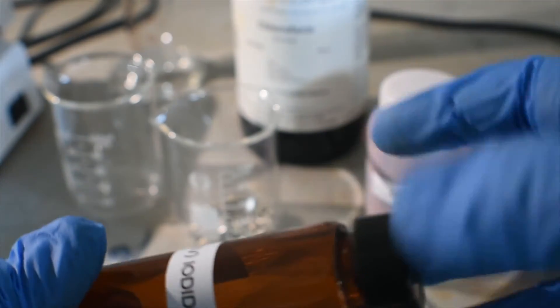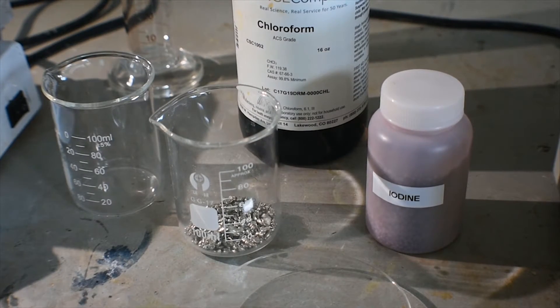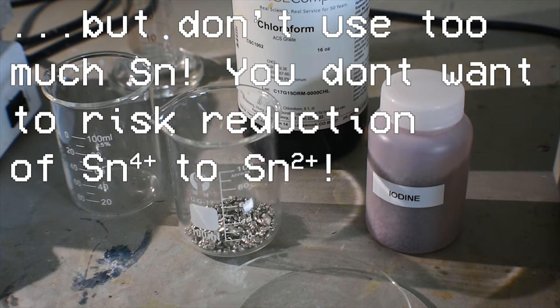First I'm going to measure out some chloroform and put that in the beaker. I'm not going to use exact measurements. This is just a simple organic preparation. I'm not going for best yield or exact stoichiometry, so I'm just going to use a slight excess of tin to iodine to make sure there's no iodine left over, and we get some nice pure tin 4 iodide without any iodine contamination.